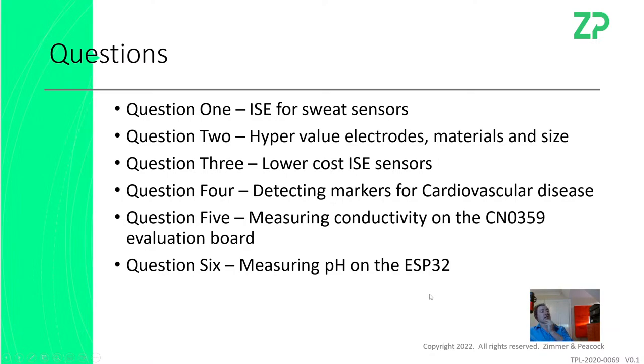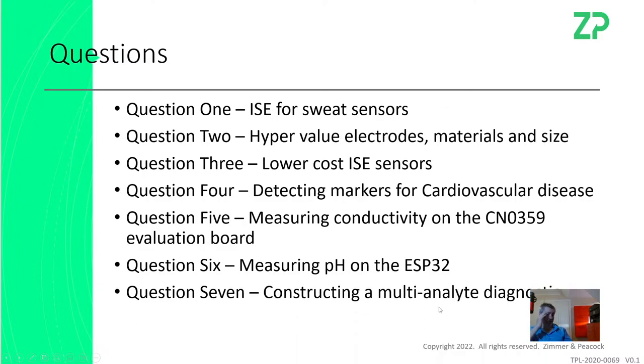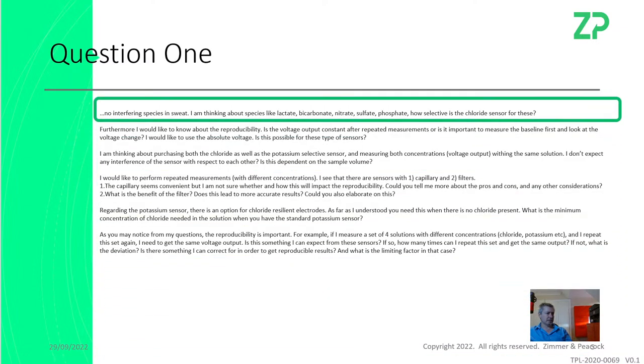When you look at this, there are a lot of ISE type questions in here, ion selective electrode type questions, because the pH electrode itself is a form of ion selective electrode. Measuring pH on the ESP32, so we'll touch upon that as well. And then also constructing a multi-analyte diagnostic. Really, I should subphrase this and say somebody's interested in making a credit card microfluidic, and I'll also touch upon that.